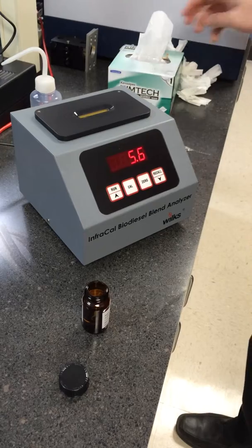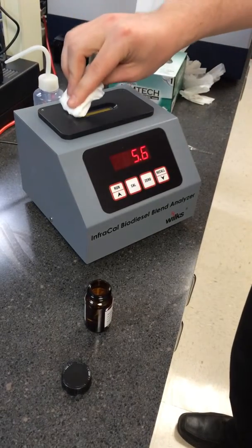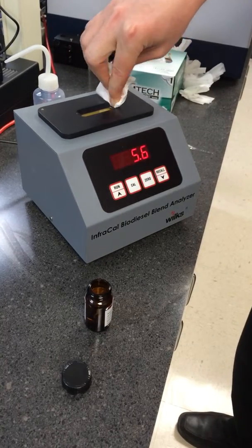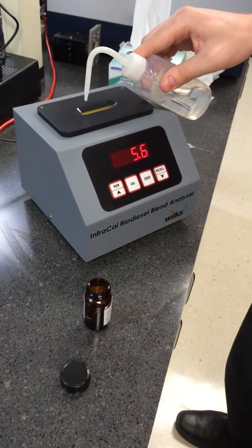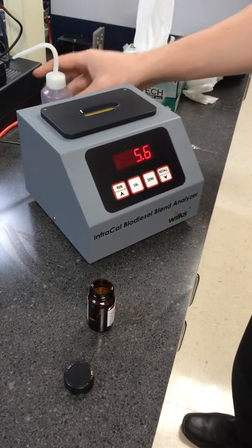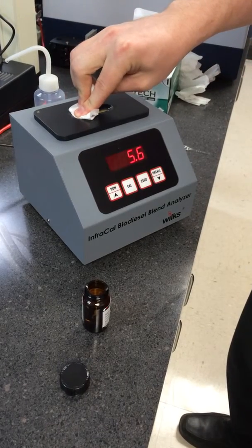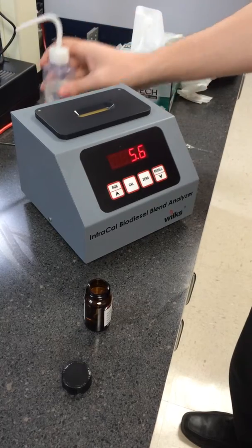Now you'll want to clean off your sample. To do so, first wipe it off in one direction. Apply your solvent and wipe in one direction, then repeat this one more time.